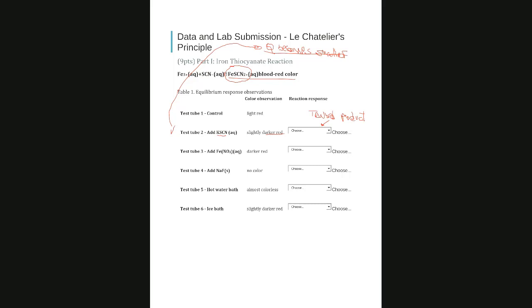Sure. Let's look at test tube 3. Test tube 3 is basically the same as test tube 2. Because what are we adding? When we look at the reaction here, we are adding, again, more reactant.